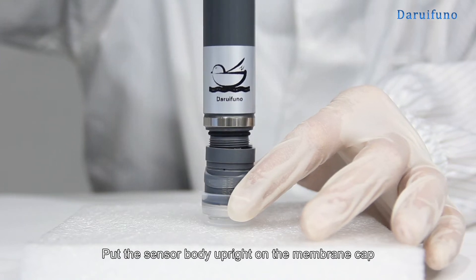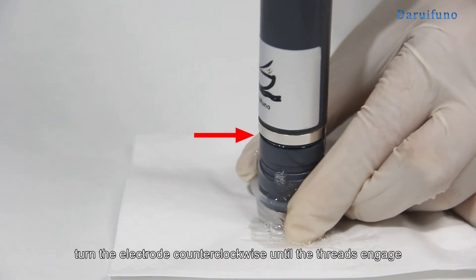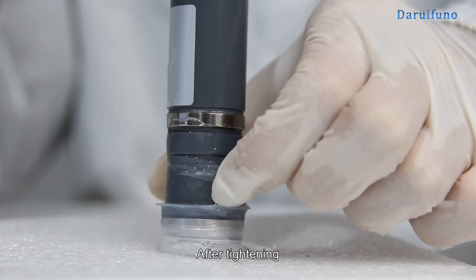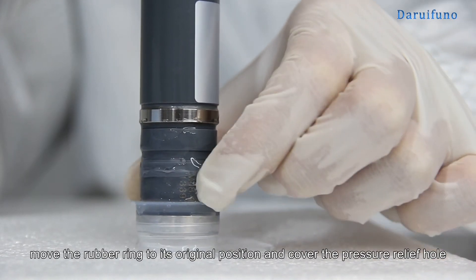Put the sensor body upright on the membrane cap and turn the electrode counterclockwise until the threads engage. After tightening, move the rubber ring to its original position and cover the pressure relief hole.